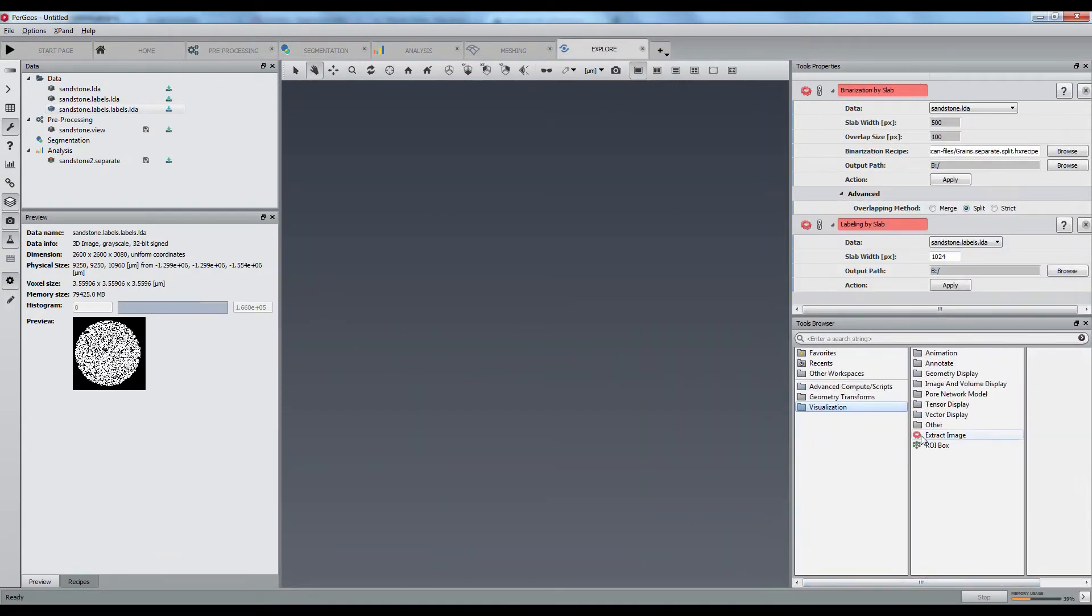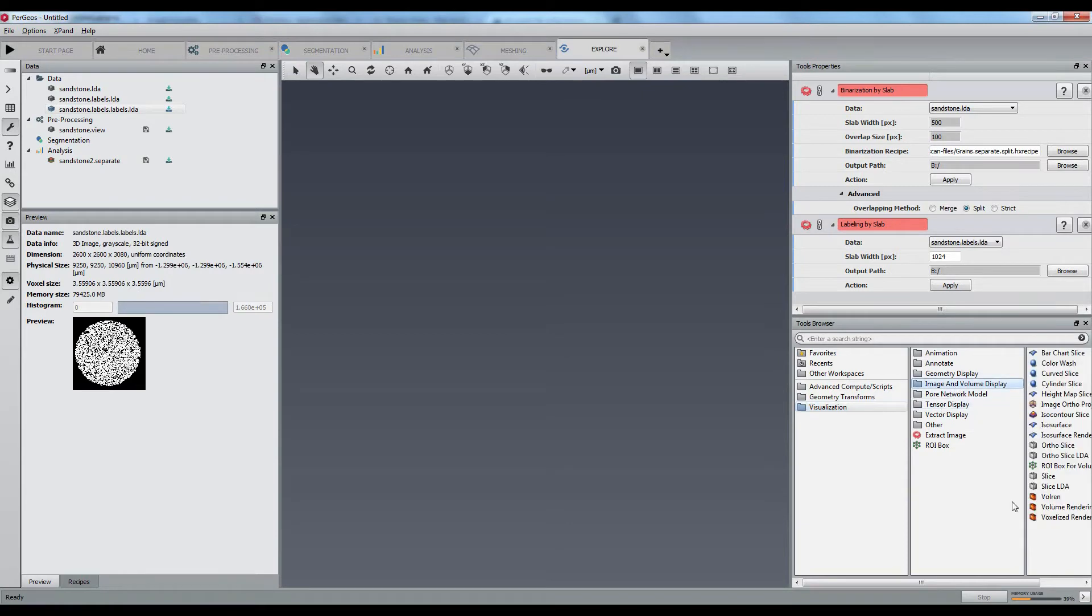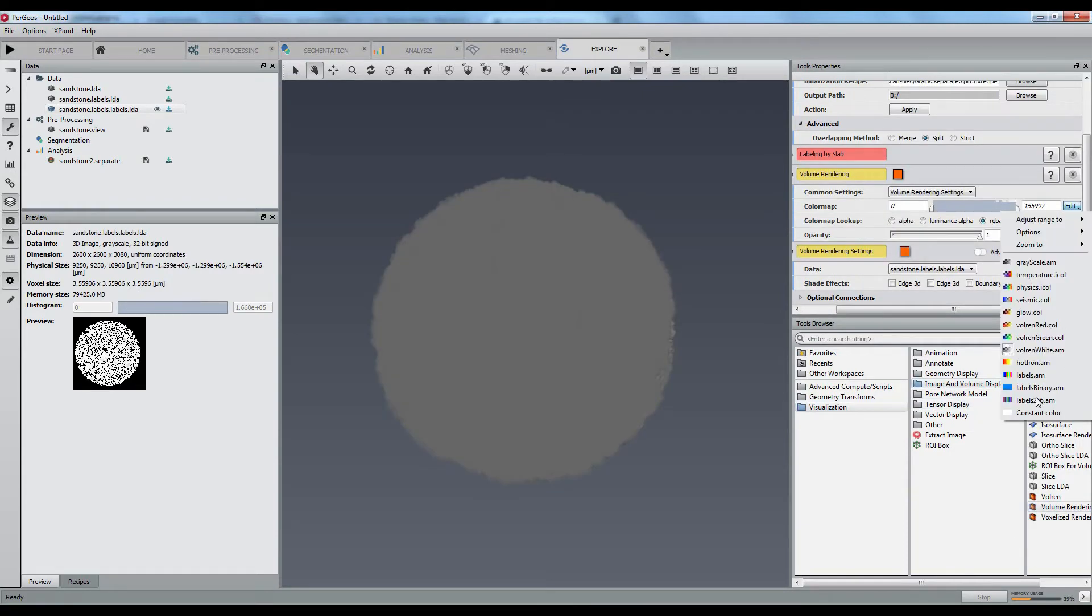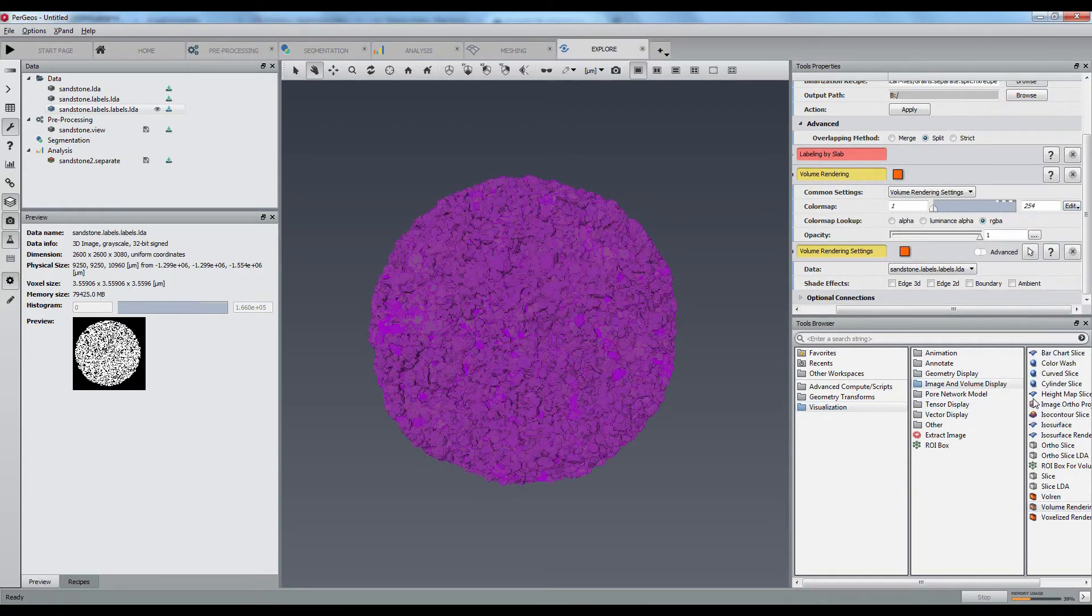Connecting a volume rendering gives you an idea of the total number of grains, more than 165,000.